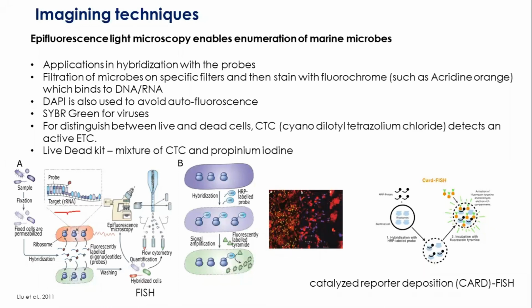And then once it is bound, you can have a look under the epifluorescence microscope, and depending on what kind of probe you have used, you can tell the diversity of the marine microbes in a particular environment. And this process can also be understood as fluorescence in situ hybridization using probes. That is why it is called FISH. Okay.